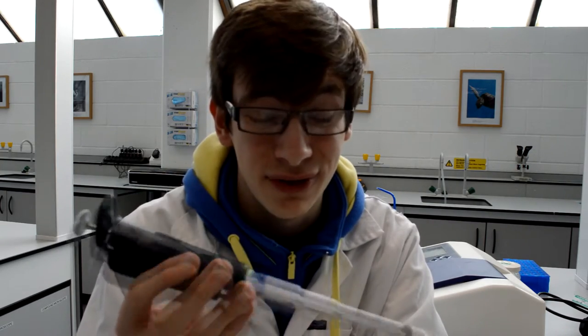These things are really expensive, and if you don't believe me, just Google it, because they really are, and they're getting old in their old age, and we want to try and save them for as long as possible. Pipettes are expensive, and there's no need to break them just because you don't understand how to use a pipette.